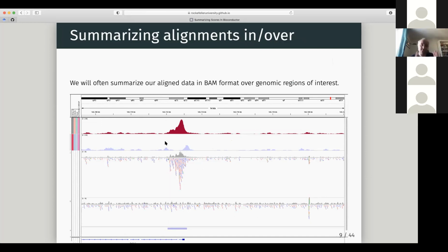Okay. Bigwigs are great for visualization, can be used for summarization, and we're going to show some of this now, but usually it's BAM files you really want to use when you're summarizing your peaks, your enriched locations from your ChIP-seq, or you're doing your counting over genes.